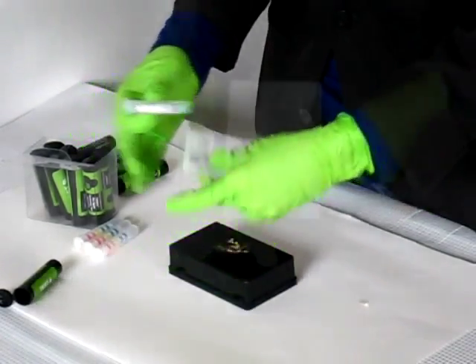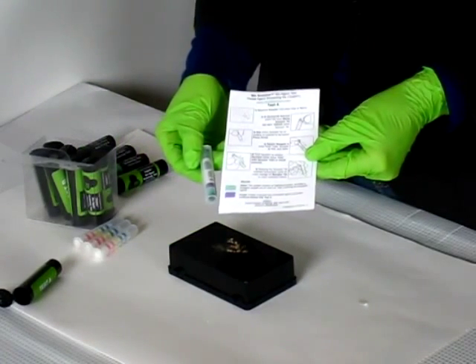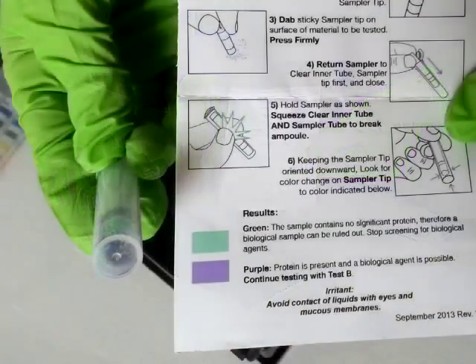The sample tip will turn color within 30 seconds — usually it is immediate. Purple is positive and indicates protein is present in the sample. This means a biological agent is possible, so continue testing.